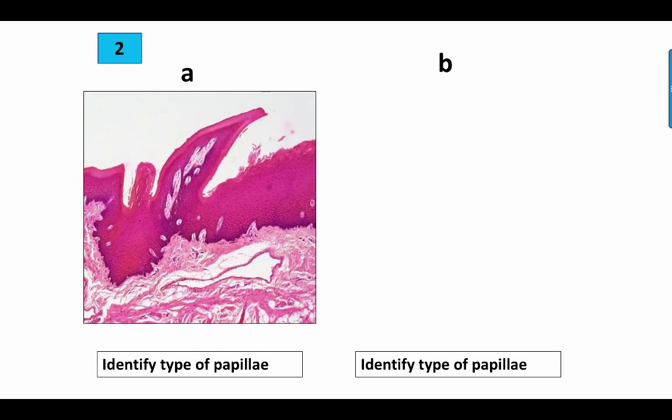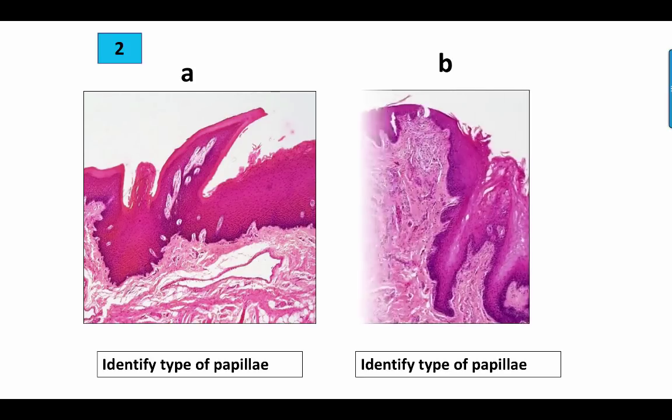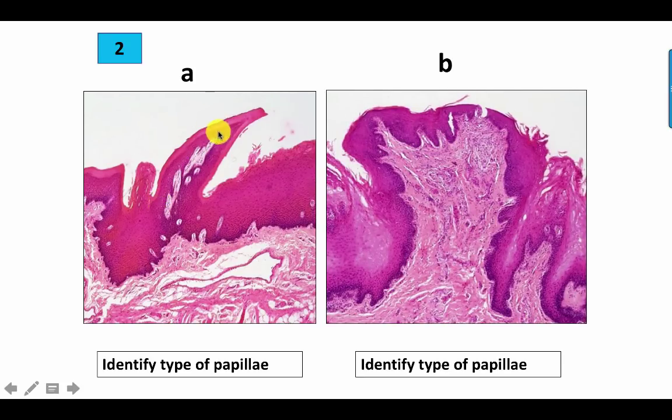Second slide, to differentiate between two different types of papillae. Here we have the conical-shaped papillae, which are the filiform papillae, devoid of taste buds and partially keratinized. And this is the fungiform papilla, broad at the top, narrow at the base, and devoid of taste buds at the side walls. We cannot see taste buds at the side walls, and of course it is projecting on the surface. However, the most important feature is the shape, and no taste buds are present at the side walls.